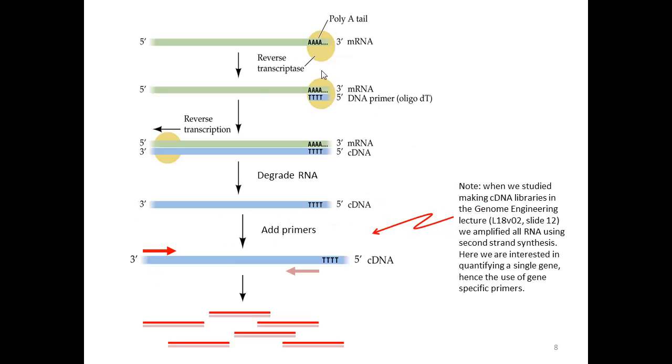So here we have the poly A tail for mRNA. And again, we'll take advantage of hybridization with an oligo-dT primer. Now we'll use the enzyme reverse transcriptase to make a copy of cDNA. Now we have a single-stranded DNA molecule, but when we put in our 2 PCR primers, we will eventually get both strands indicated by the dark red and the pink color. These are double-stranded copies. When we have many copies, we can visualize this on a gel electrophoresis.